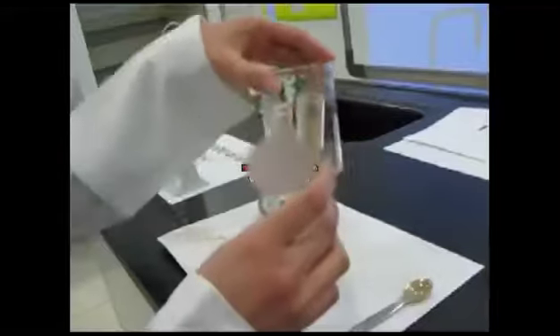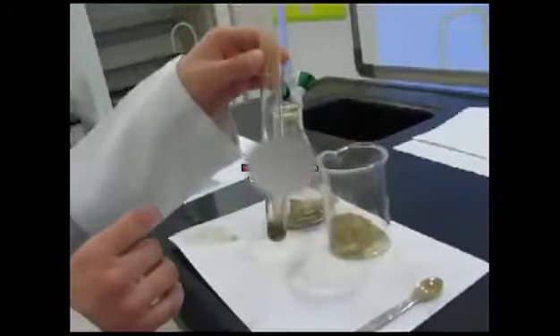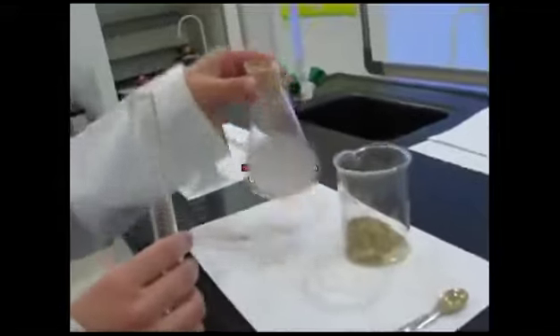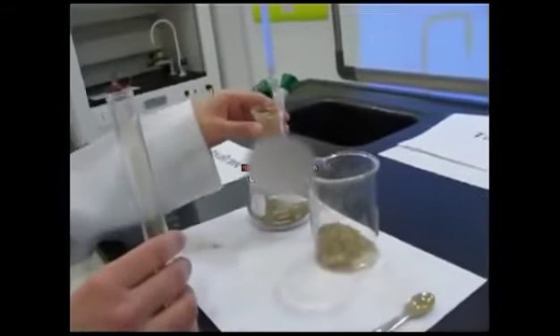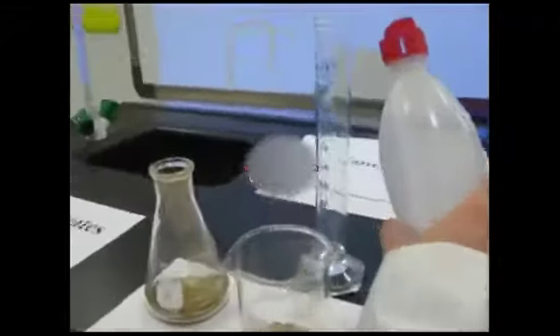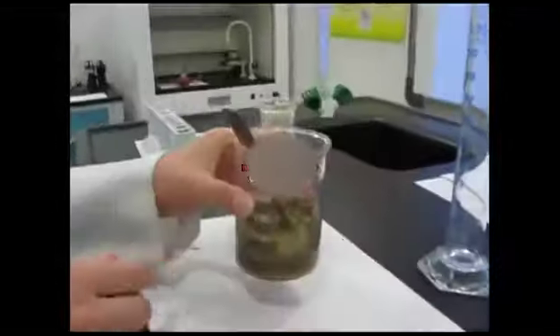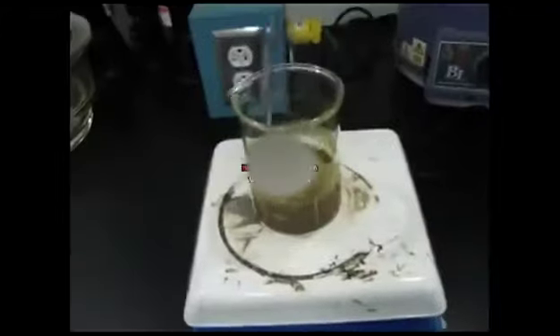The sample should be homogenized. The first part will be taken into a beaker, the second part into a test tube, and the third part into the flask. First of all, we will be doing the aqueous extraction. So we are adding about 70 ml water to this one, and mixing it well.